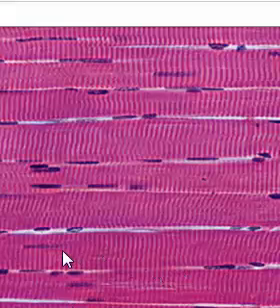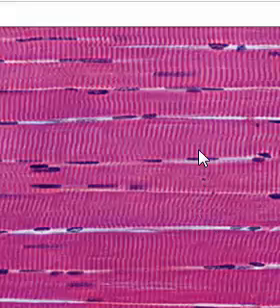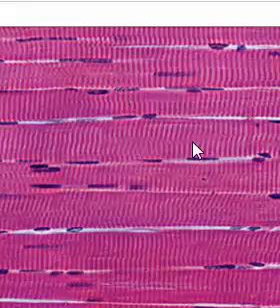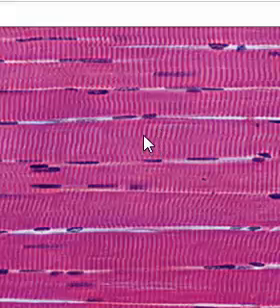First let's look at the fibers. We can see that they are multi-nucleated. What else can we see? Striations. And we can see this type of muscle around the mouth, around the eyes, many types, many parts of the body.